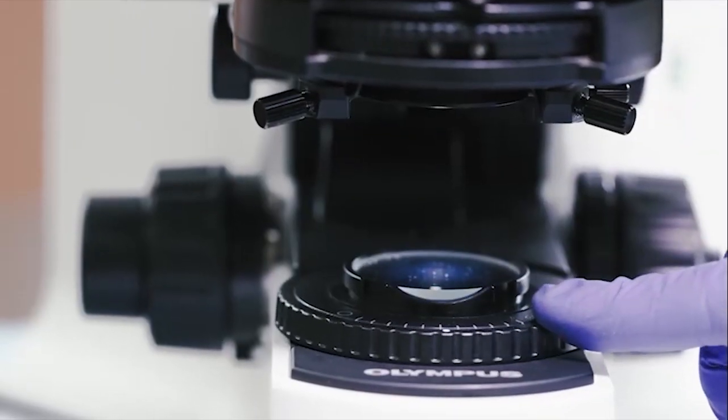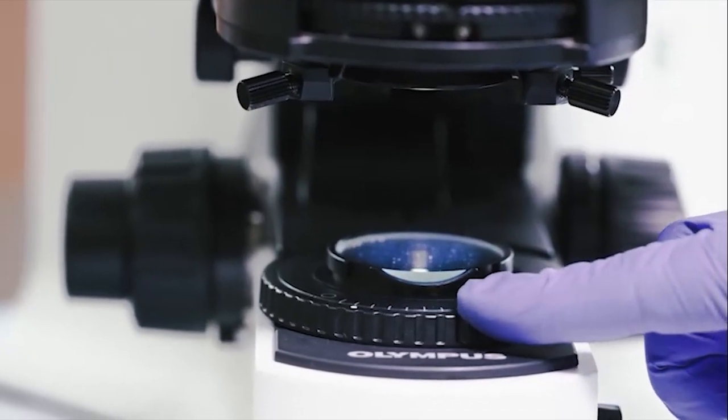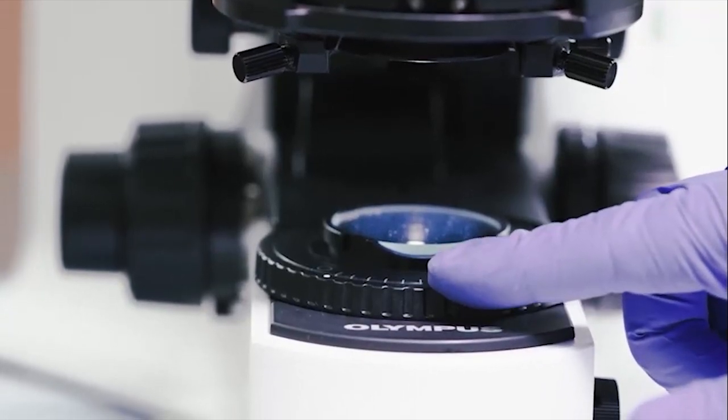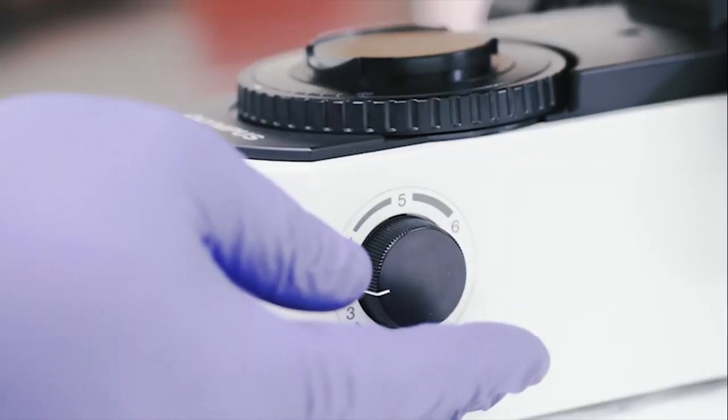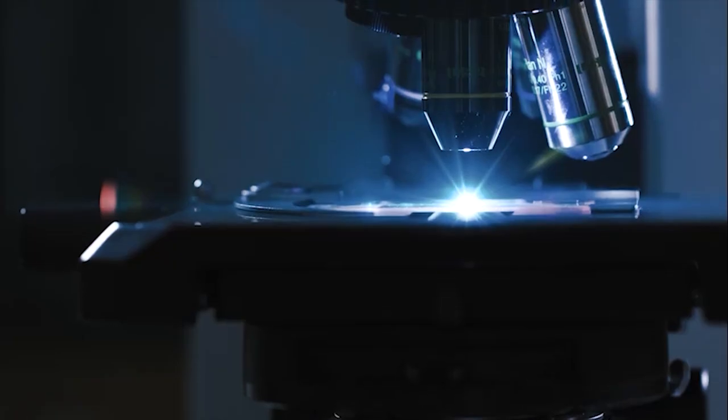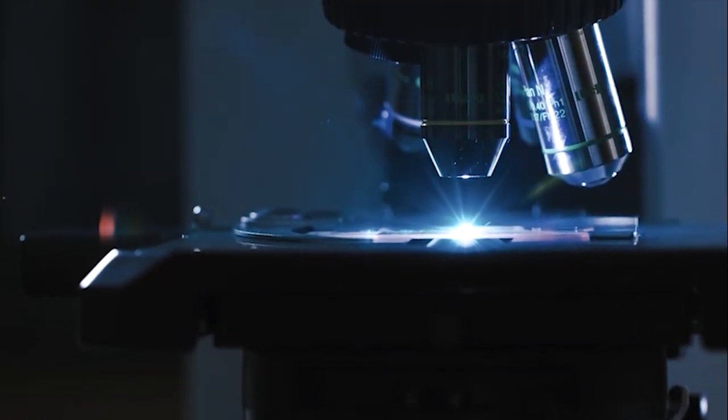Open the field diaphragm until the illuminated image is just larger than the field of view. If more light is needed, use the light source knob. Kohler illumination is now set.